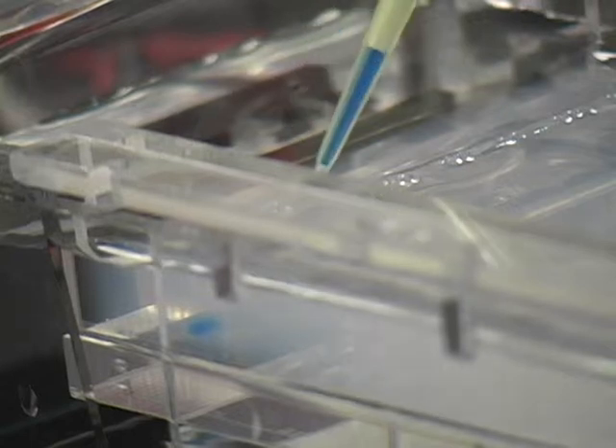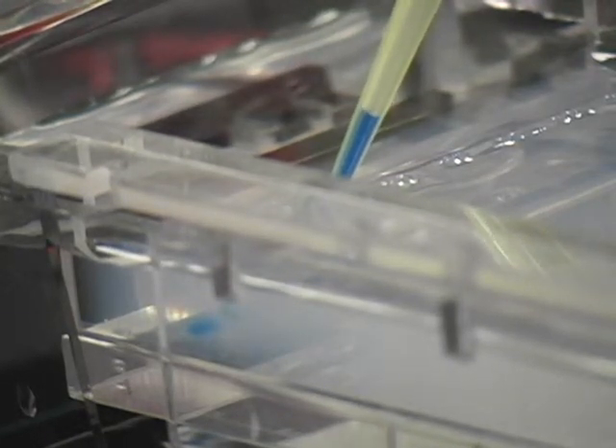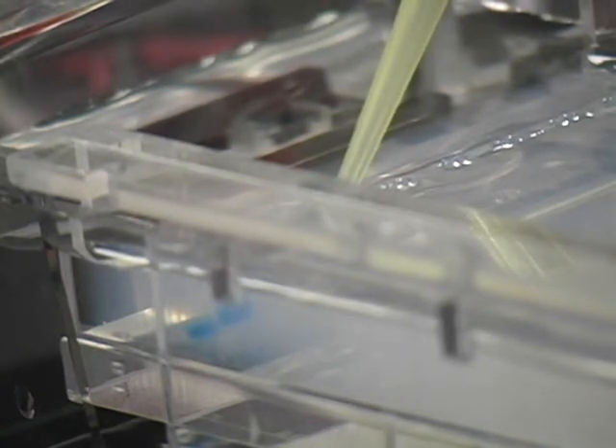To get the bacteria, we grew the bacteria overnight in a media which contains an antibiotic. So only the bacteria which contain the plasmid will be able to grow in the presence of the antibiotic. Bacteria which do not have the plasmid will not be able to grow because they don't have the resistance to the antibiotic.